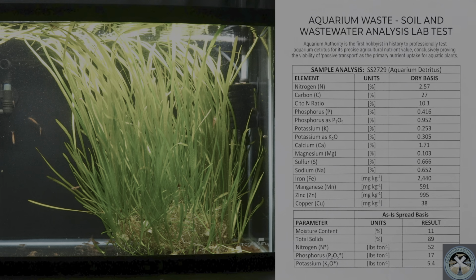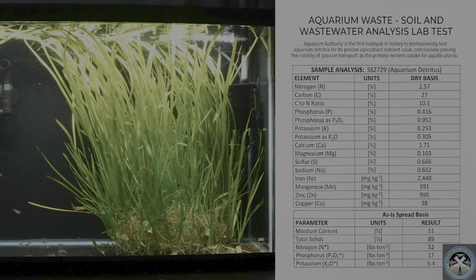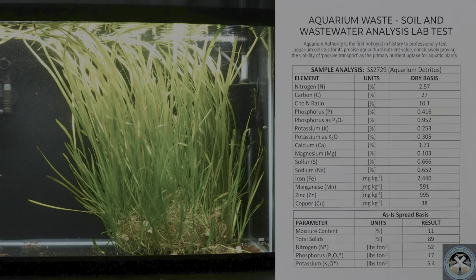Now, like I mentioned before, some of these percentages listed can be confusing because you're like, okay, well, some of this is listed as, just as an example, 2.57% nitrogen, but below that, we've got iron listed as some crazy measurement. What do those mean? So I'm going to break it down.